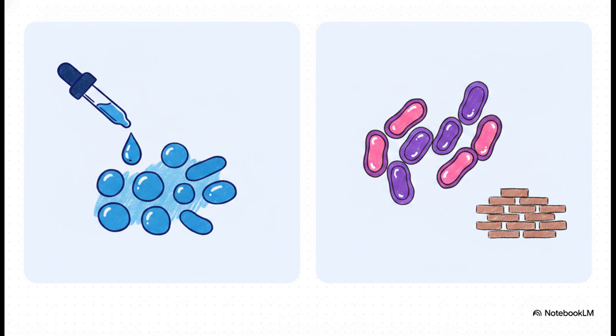Let's get into the staining phase and see how this really builds our case by bringing invisible bacteria to colorful life. We've got two primary painting techniques. Simple staining uses a single dye, like methylene blue or crystal violet. It's fast and does a great job highlighting the basic shape, size, and arrangement of our suspects.